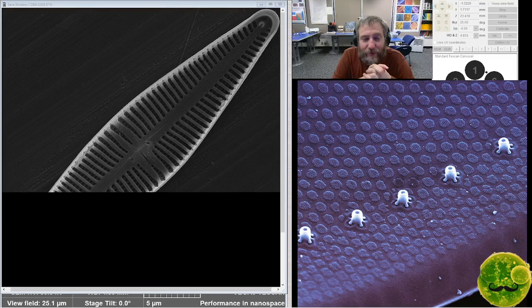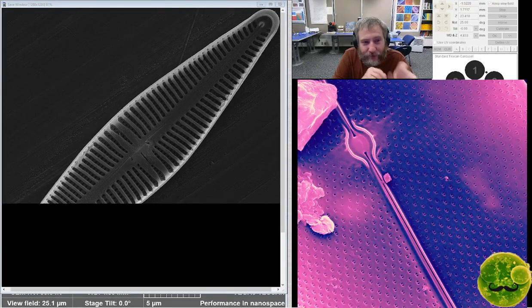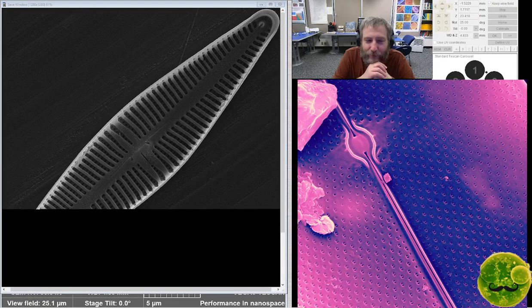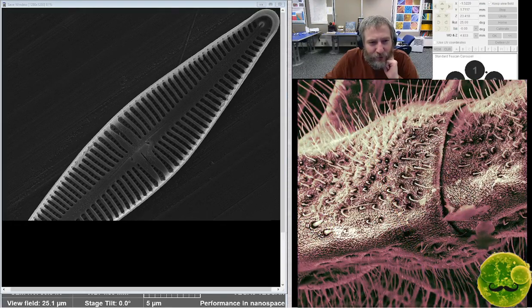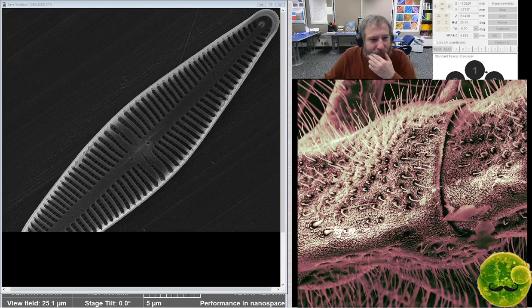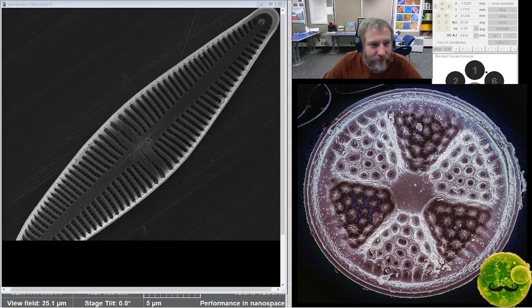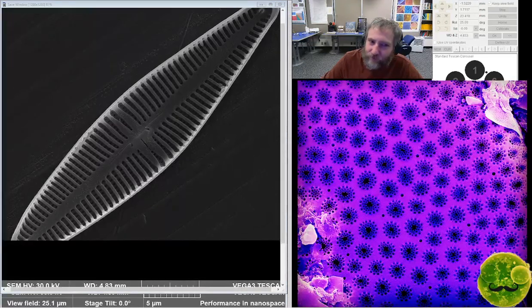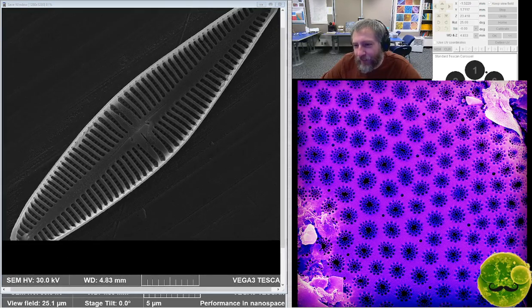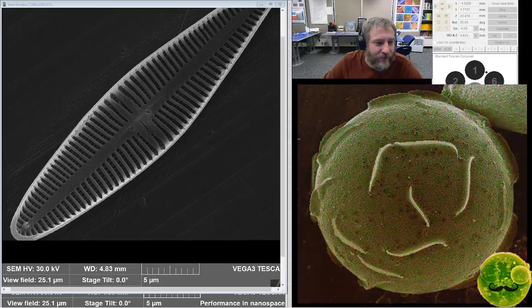But it's not a normal Gomphonema. It's a little too asymmetric, and the stigmoid is slit-shaped. But it's not a very good Afrocymbella because the intermissio is missing. The connecting piece between these two is normally sort of like a smile, and it makes this look like a little cat face, basically. And that part is missing. So I need to look very closely at tanganyikae in SEM and see what it looks like, and then what this could be. Yeah, a new mystery. I probably mistakenly identified it as tanganyikae, though.